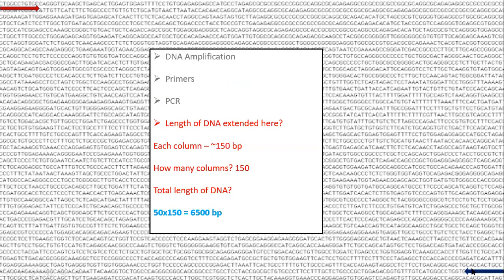Remember that DNA amplification is assisted by DNA polymerase, and the polymerase can add a nucleotide only at the 3' end. So this is 5' to 3', and this is the reverse primer, 5' to 3'. So basically you come from the front and you come from the back, and you design a specific forward and reverse primer. Based on that, you amplify the DNA given here using a PCR reaction. That is the typical way you go.